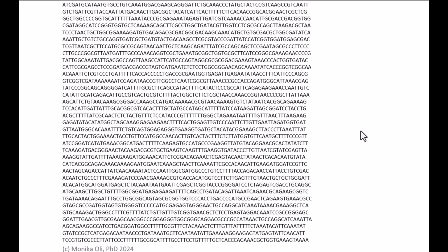And again, just like in all the other examples before, it's just a sequence of unidentifiable patterns. So you need another tool to use that long sequence with all the different genes and elements in it, figure out where your GFP, your green fluorescent protein, is, how you can cut it out, and how you can clone in another gene.